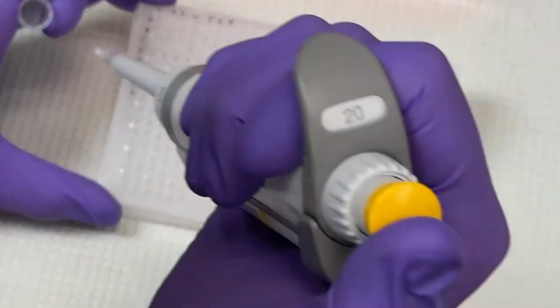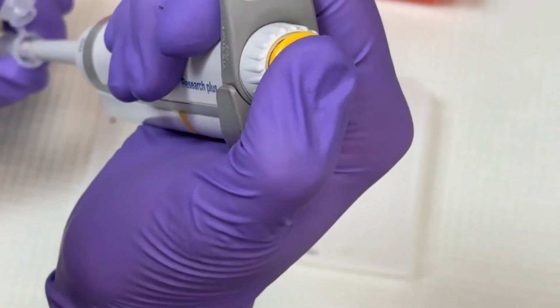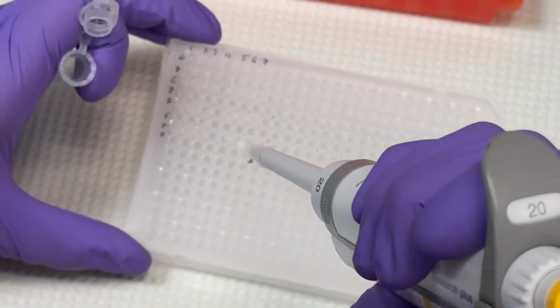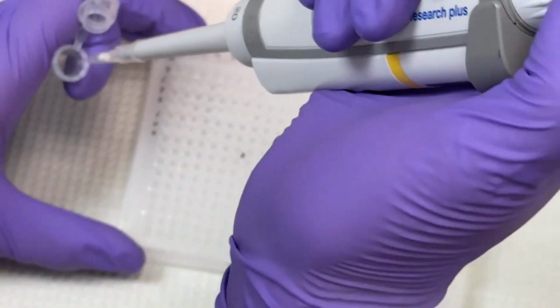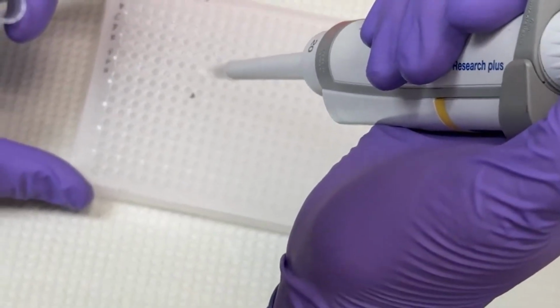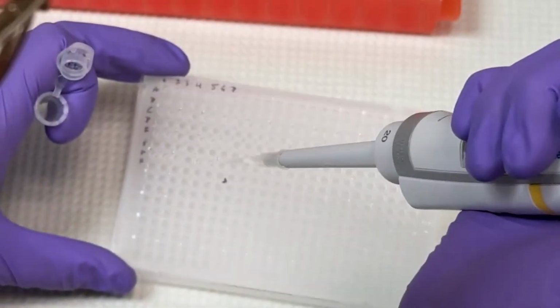And now, sometimes you can tilt the plate like this and get a reflection off of the solution surface if you're having trouble seeing what's going on. G5, G6, and last one, G7.